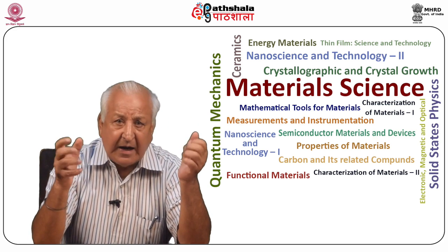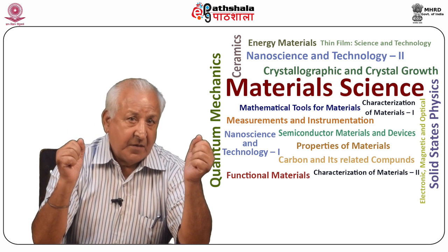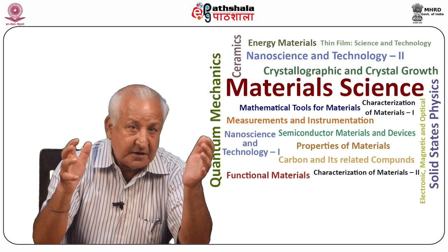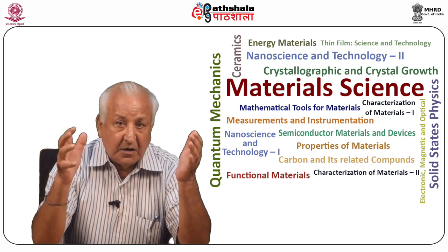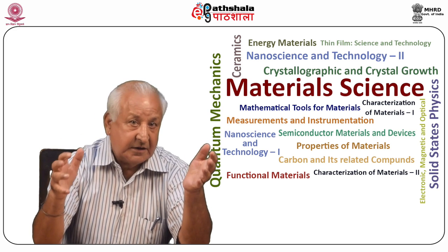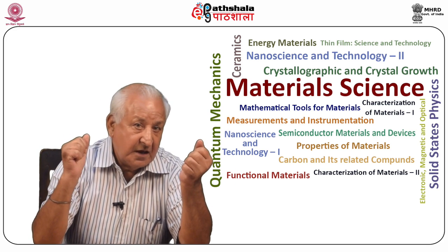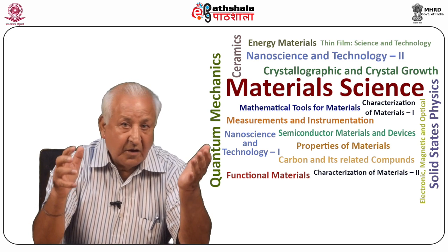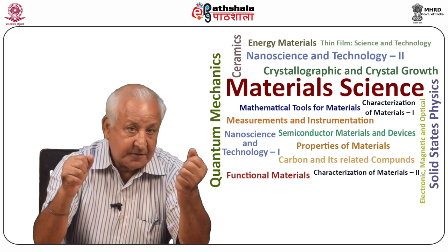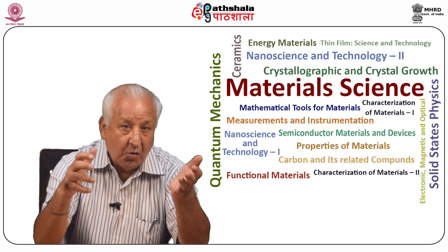The topographs are recorded by a Lang camera using a collimated X-ray beam with horizontal divergence of about 3 minutes of arc. The geometrical resolution of the apparatus has been estimated to be about 0.3 micrometer. The topographs were recorded in reflection, that is RXRT, and transmission, that is TXRT, scanning geometry. In certain cases, AgK alpha radiation was employed after having thinned down the samples to about 150 micrometers. In other cases, CuK alpha X-ray wavelength was used as the probe of investigation.